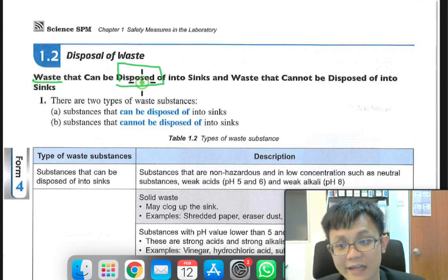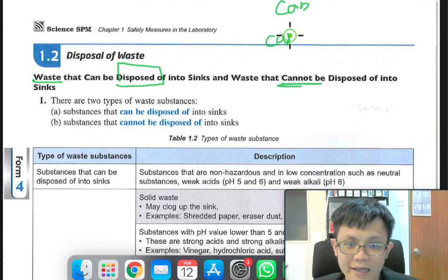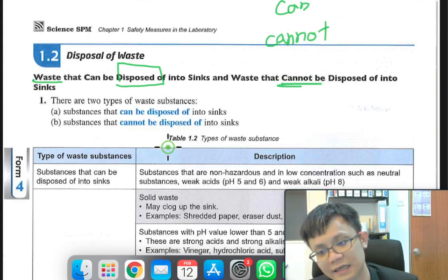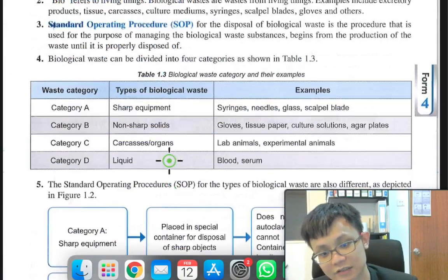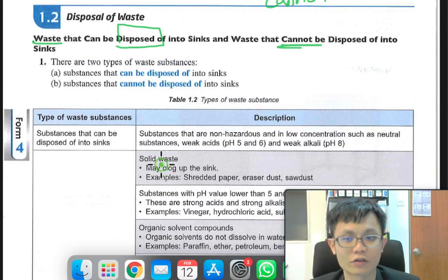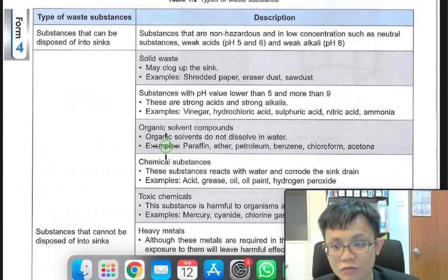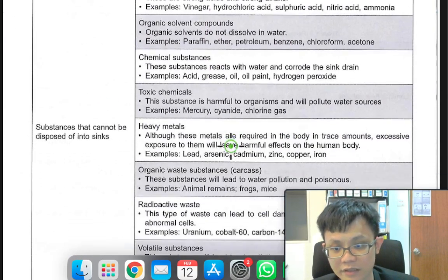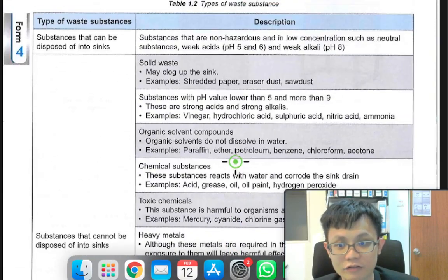So how can we dispose the waste? Sometimes can and sometimes cannot. A common thing people do wrong, I see sometimes, is that the aunties like to dispose hot water into the sink. Do not dispose hot water into the sink. Why can we not dispose hot water into the sink?